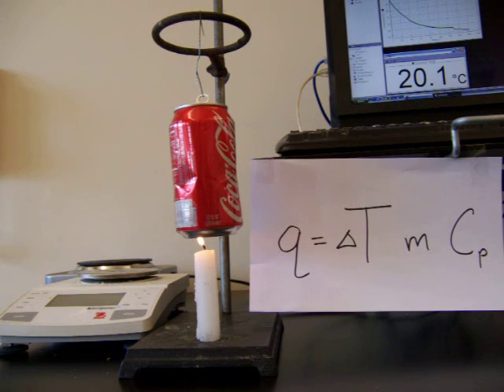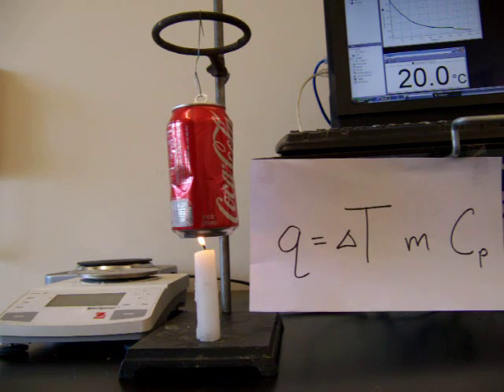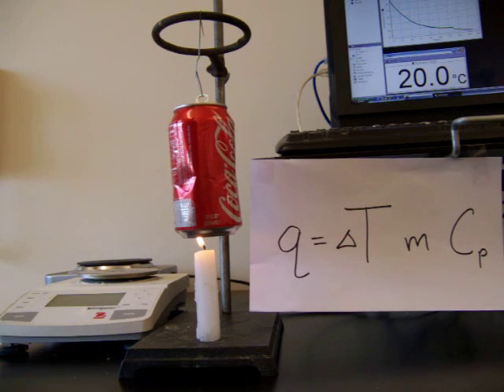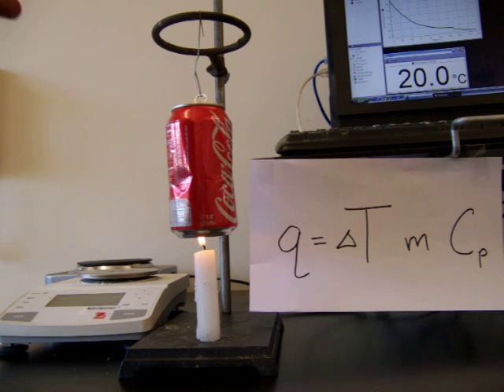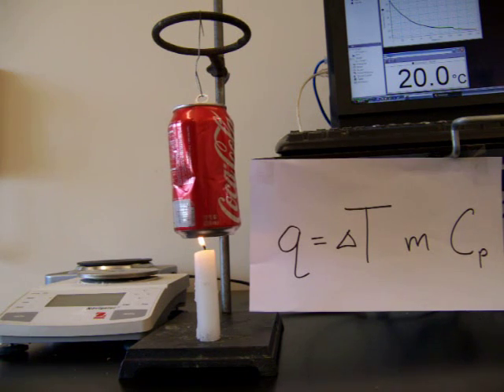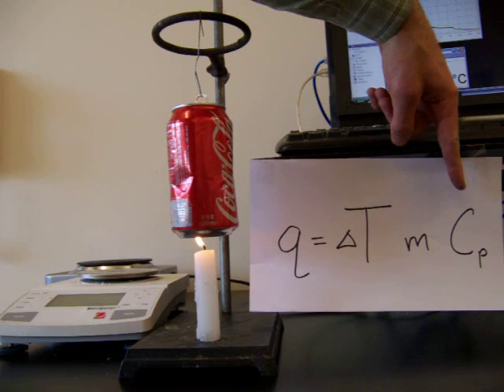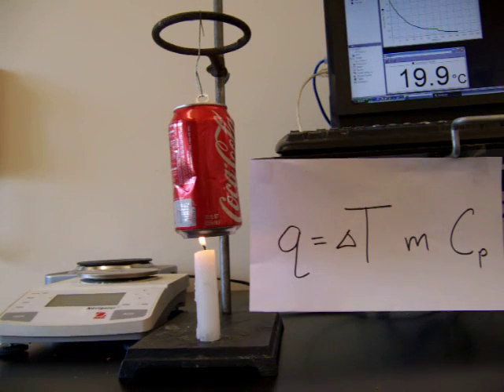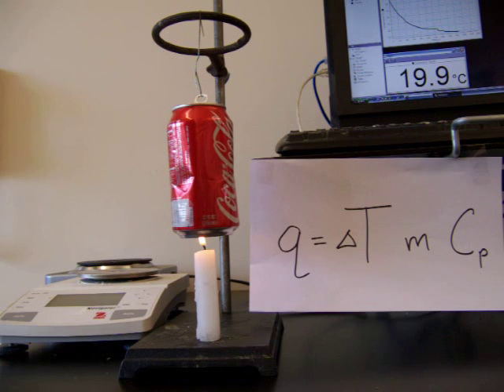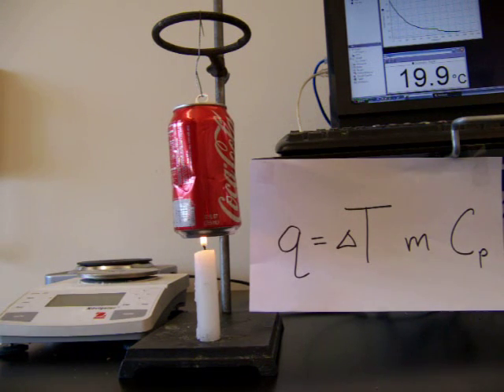As the candle is burning and releasing heat into the soda can, I can talk for a minute about the calculations. We're going to use the equation Q is equal to delta T times mass times specific heat for this lab. Whenever you're doing calorimetry, the heat is being released, and it's going into some water. We know the specific heat of water, and we're going to be able to use the specific heat of water, the mass of water, and the temperature change of the water to figure out how much heat was absorbed by the water. However much heat was absorbed by the water is equal to the amount of heat that was released by the reaction.